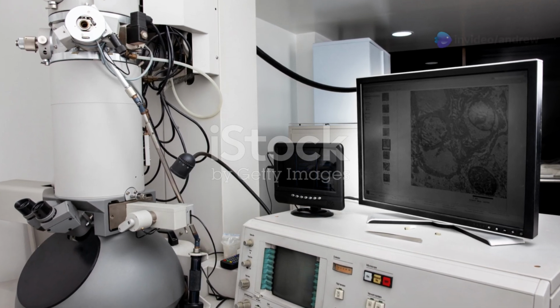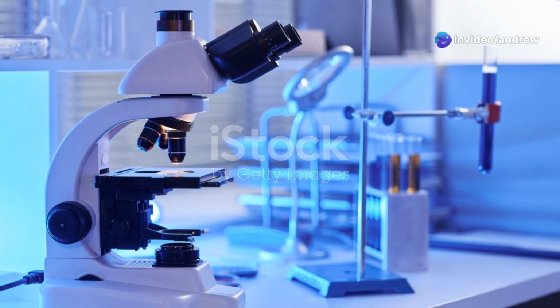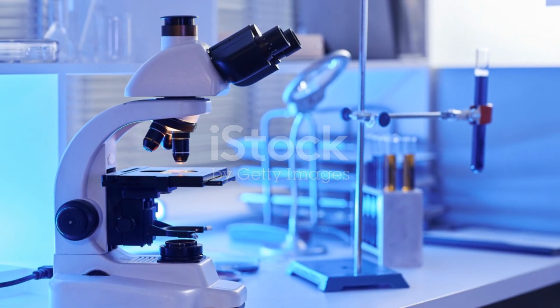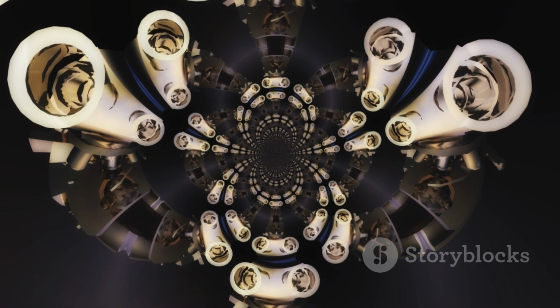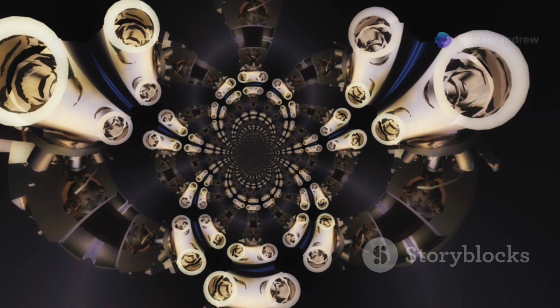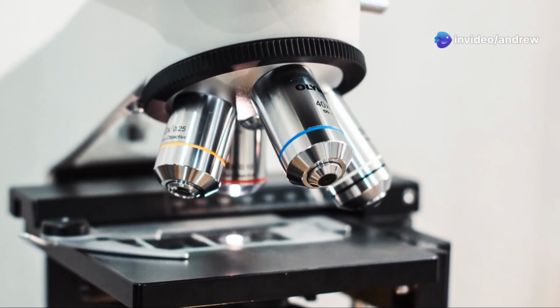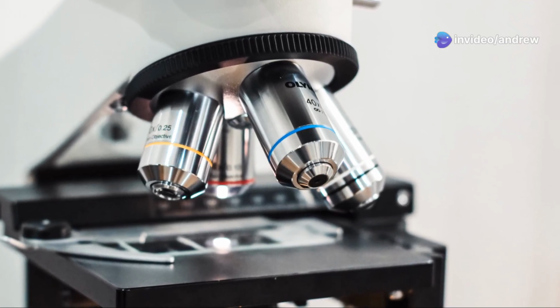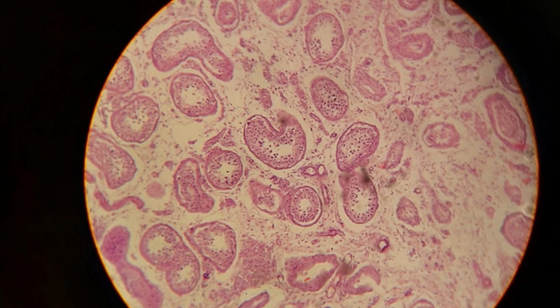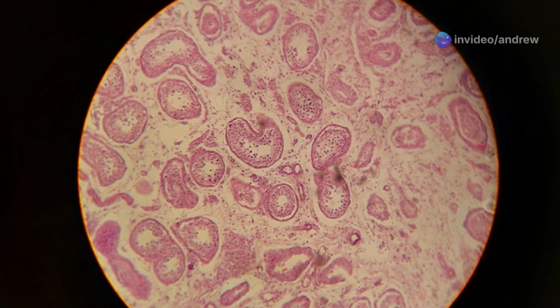Electron microscopy is a constantly evolving field. New technologies and techniques are constantly being developed, which are leading to even more powerful and versatile electron microscopes. One promising area of research is the development of aberration-corrected electron microscopes. These microscopes use sophisticated lenses to correct for aberrations, which are distortions that can occur in electron beams. Aberration-corrected electron microscopes can achieve even higher resolutions than traditional electron microscopes.